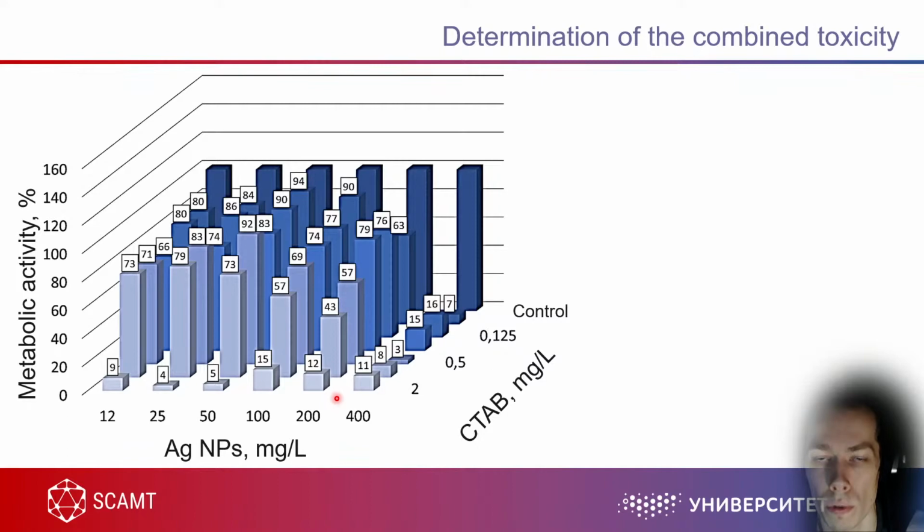You need to observe your cells with your own eyes, and use fluorescent staining, fluorescent microscopy to understand what happened to the DNA, what happened to the reactive oxygen species level in your cells, to add some DCFDA to your cells and so on. So MTT assay and all other assays are indirect ways, and they give you just basic information which cannot be further used. Just only MTT is not the best option.